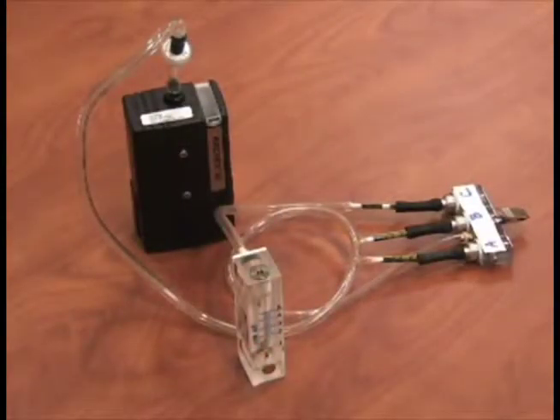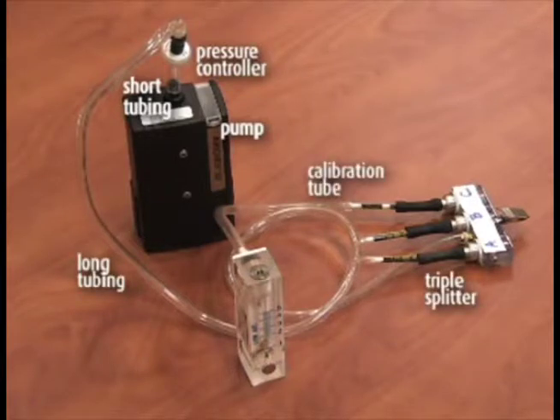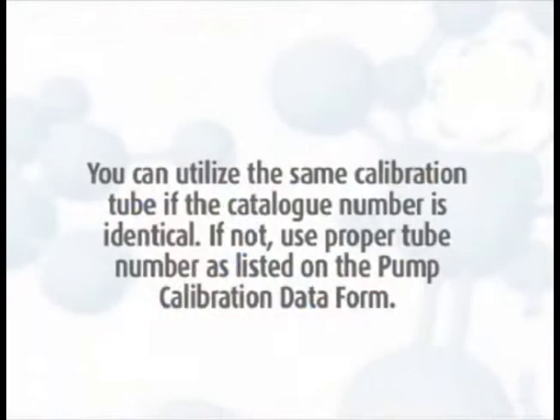For triple splitters, set up the calibration sampling train as follows: pump, short piece of tubing, constant pressure controller, long tubing, triple splitter, and calibration tube rotometer. The triple splitter will have three ports labeled A, B, and C.